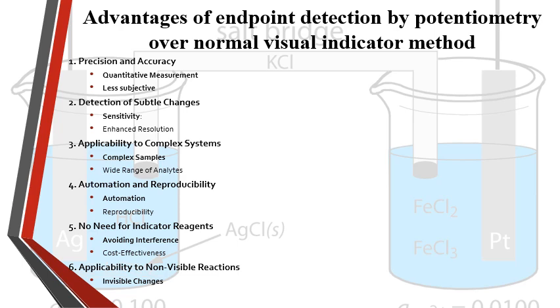Let's dive into the advantages of endpoint detection by potentiometry over normal visual indicators. Here are some key points.